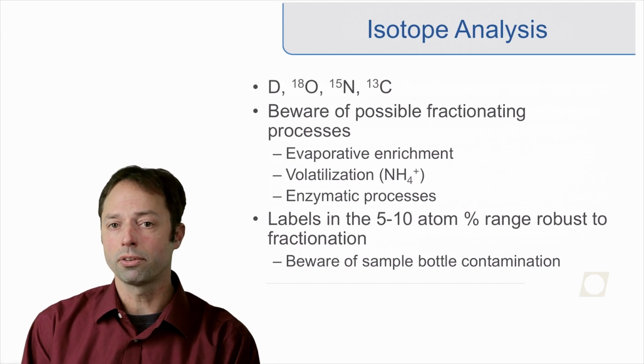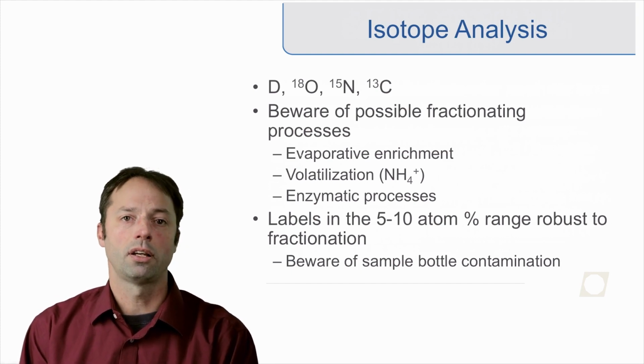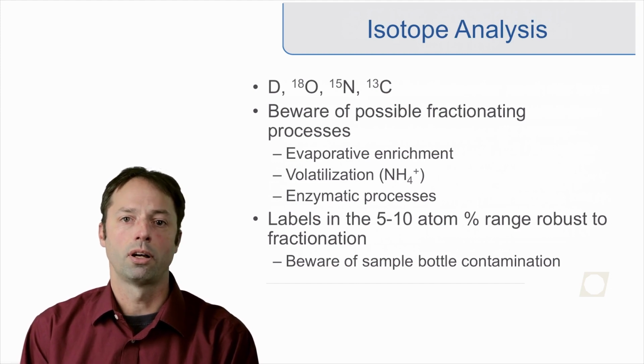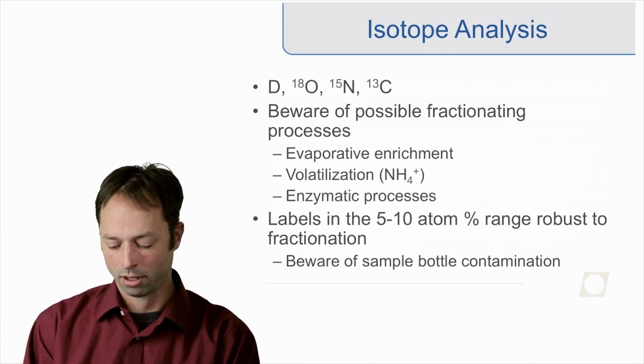If you're using a label, say if you're extracting some label that you've added in an experiment, then you generally don't have to worry about fractionating processes. So that's not really a concern, but you should be aware of sample bottle contamination in these cases.